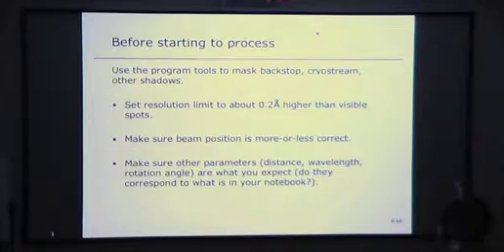And the last point is, when you've looked at your images, ask yourself, should I continue with this and struggle perhaps? Or should I just throw these data away and collect something off another crystal? Also, as Phil said, check two images at 90 degrees to each other, because very often crystal pathologies that you see in one orientation are not apparent in another, because crystals are not generally isotropic.